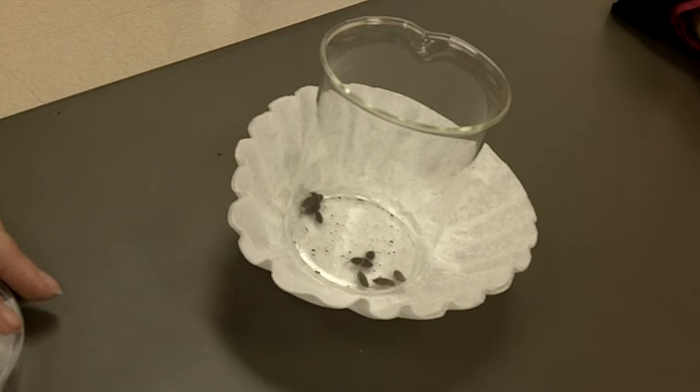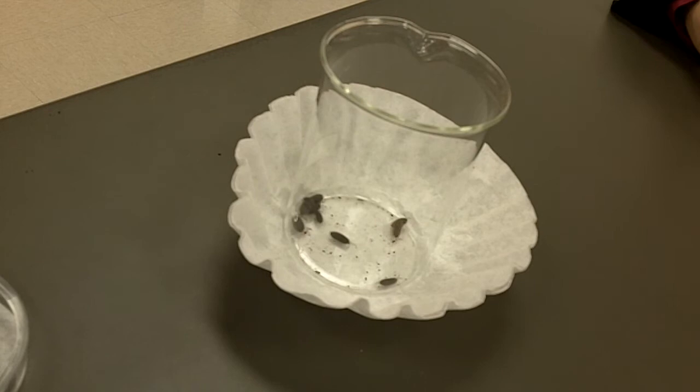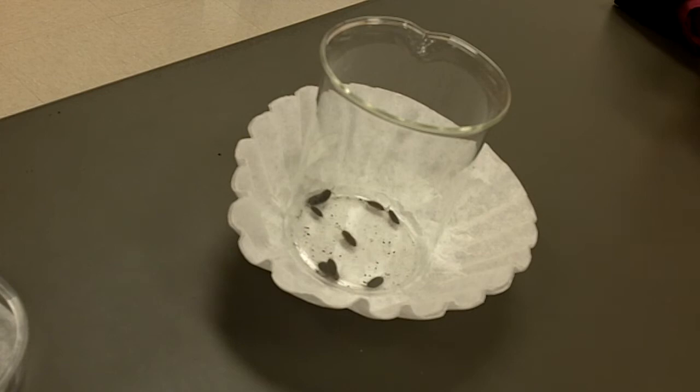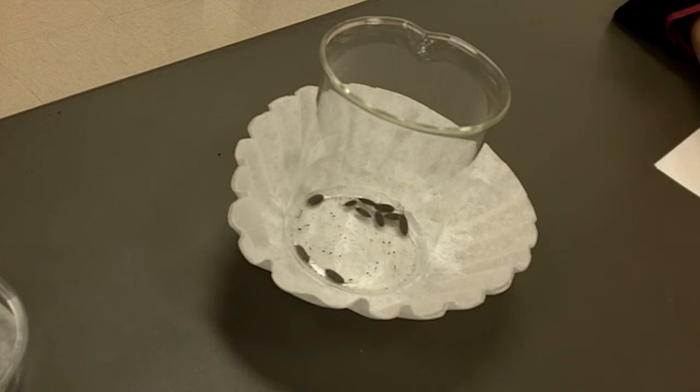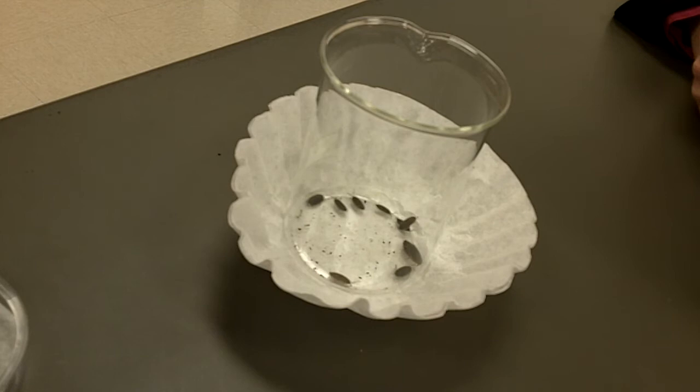If you decide to do it this way for your experiment, think about how you would describe this to somebody else. At first, when Nikki did it, and you're reaping the benefits of someone else having already done this, which is what you want to do in research - build upon what other people have done. We started off with counting drops and then she realized it didn't always work because these droppers, if you squeeze differently or if the bottle gets low, you're going to get different size drops. We finally got generic where it was add enough drops to saturate the area.